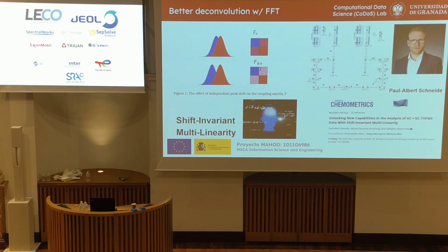Also, Paul Albert Schneider, who was a co-author in the previous presentation, he did this really big brain thing. And we published this article in the Journal of Chemometrics where we showed that the deconvolution algorithm I proposed isn't very good. But that's okay. That got my h-index up to 1. And you can see that unfolding the data, this was my contribution, unfolding the data for GCxGC-TOFMS data has an impact on the coupling matrix in the PARAFAC2 model, and that makes it not ideal, unfolding the data for PARAFAC2 analysis. So hopefully he's going to come to Granada, and we're going to implement this in the next release of the software, after the first release of the software.